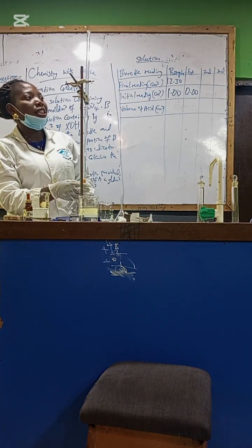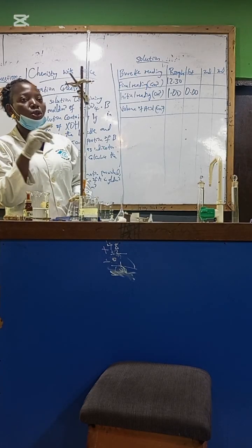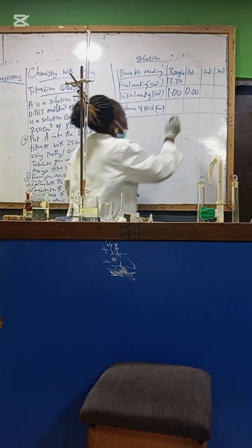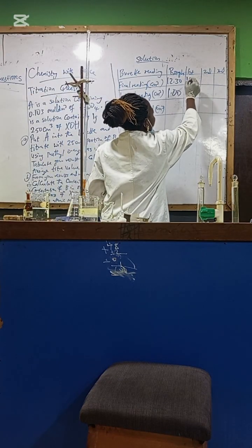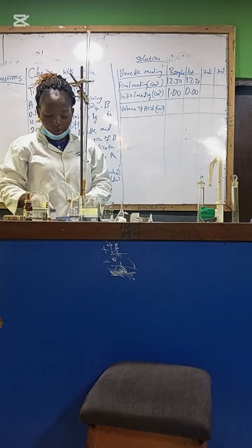So the color changed, as the first one changed, at 12.20.